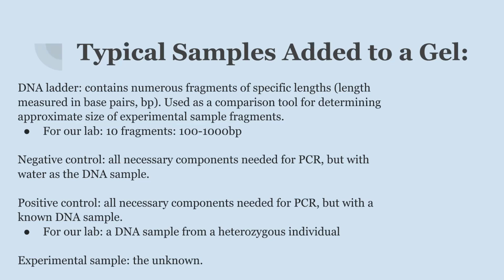So the results that you're going to be using to interpret your lab reports is going to be based on that. And I'll show you what that would look like on a gel plate. And I do have actual results from gels that students have run in class if you're curious about looking at those, but yeah.